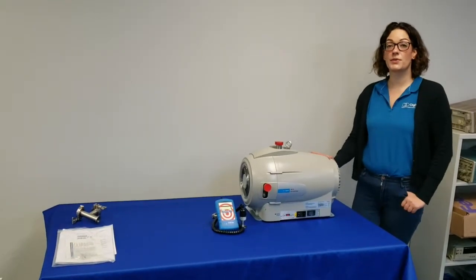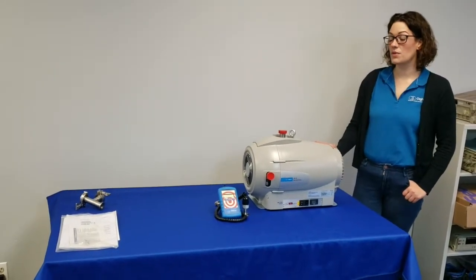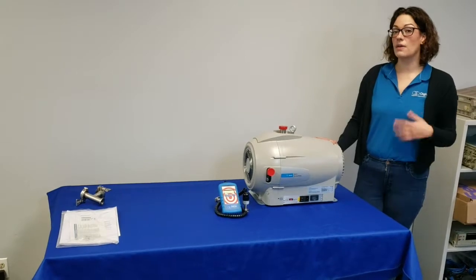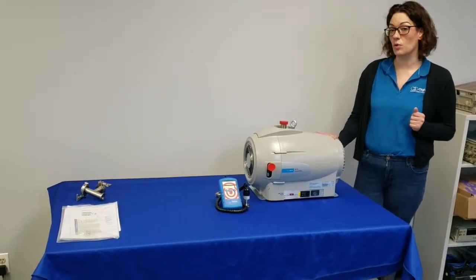Hi everybody, my name is Hilary Trappagin. I'm the lead calibration tech at Digivac, and today we're demonstrating the startup and operational procedure for the Agilent IDP15 dry scroll pump.